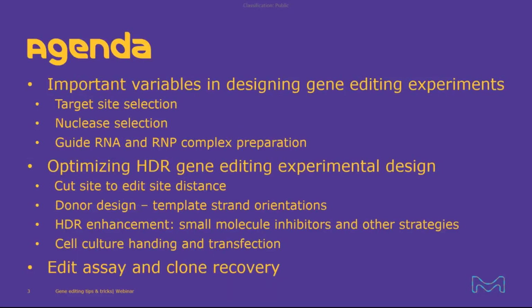In today's webinar, I will share with you my experience in optimizing gene editing experimental design. First, I will discuss target site and nuclease selection, and guide RNA and RNP complex preparation in the context of CRISPR gene editing systems. And will then focus on HDR gene editing.